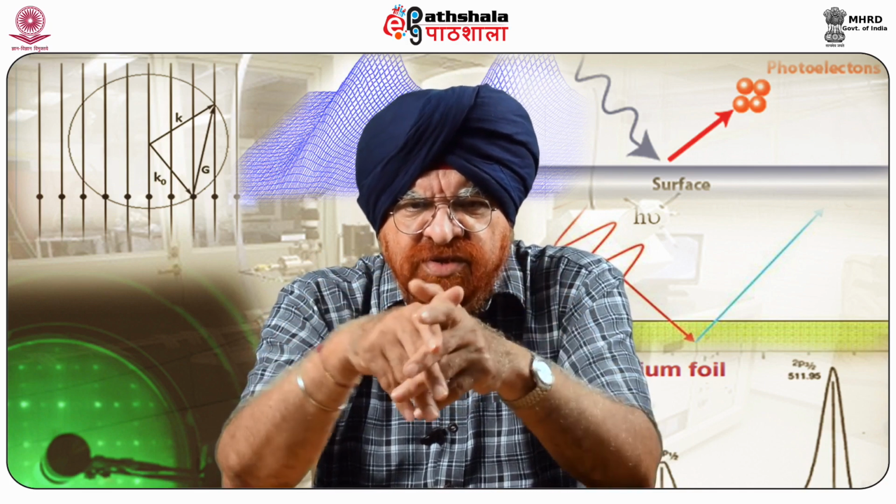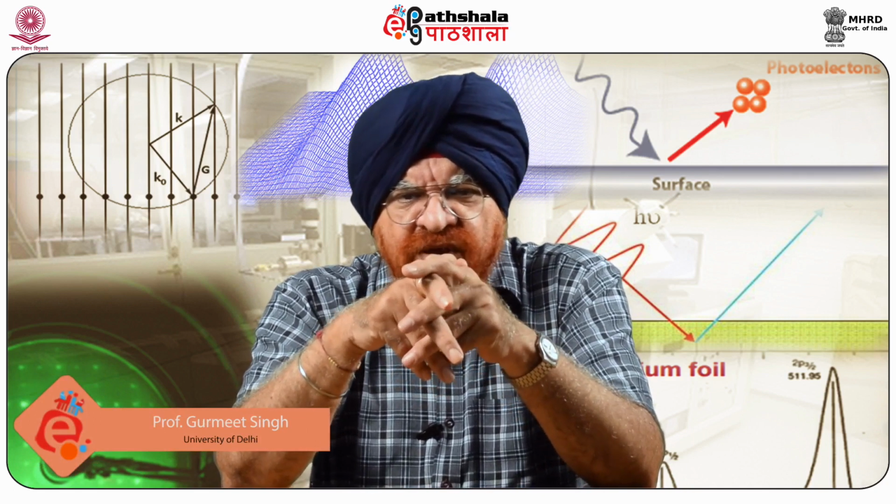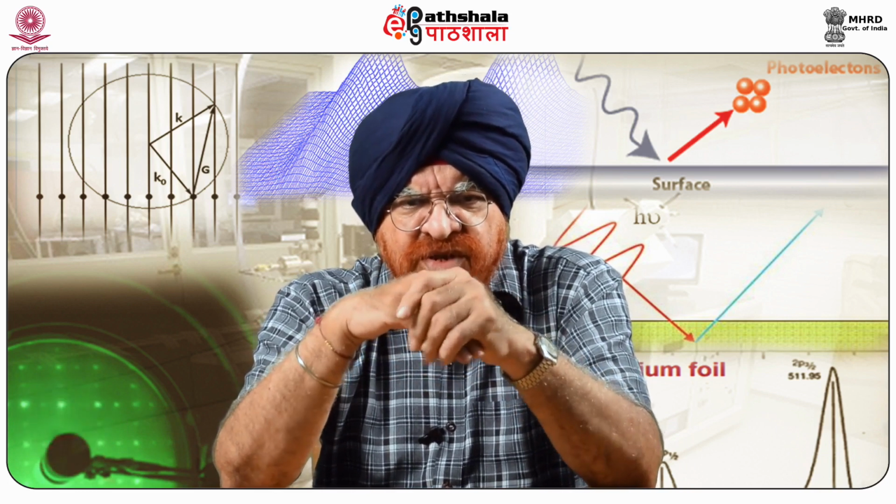This finds great applications towards these areas where interactive forces are to be measured at nanoscale domain, that too on a surface which is more of a heterogeneous one between the other two kinds of species. The heterogeneity of the surface, chemical properties of polymeric materials can also be measured with the help of CFM.